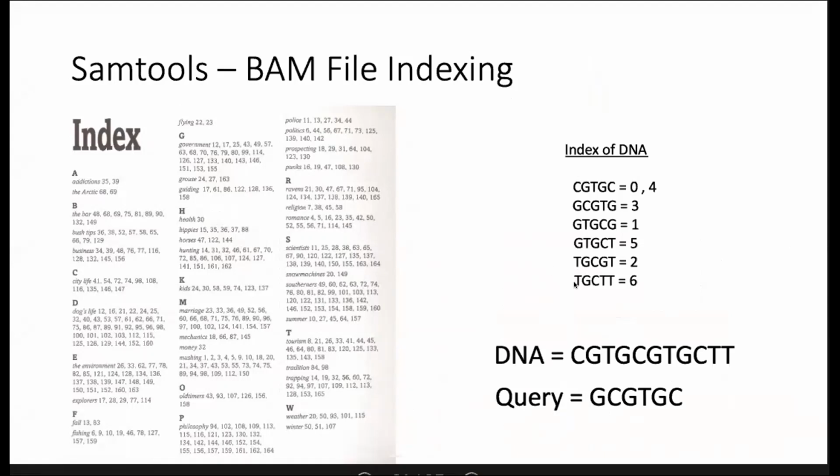We can see that the first 5 nucleotides here align to offset 3. After the offset is identified, the remaining nucleotide is validated against the actual reference genome to see if it actually fits. By doing this, we make the computations much quicker, and this needs to be done for our BAM files for further processing and to visualize our BAM files.